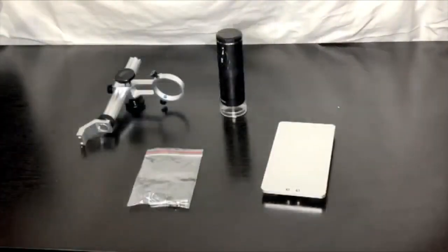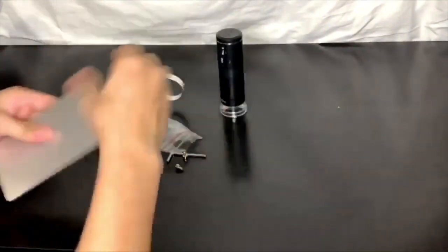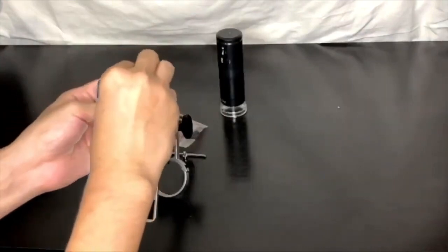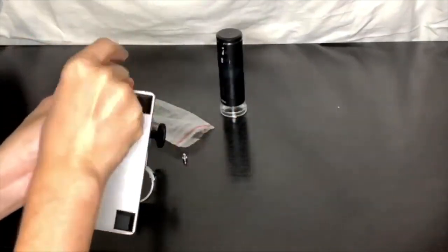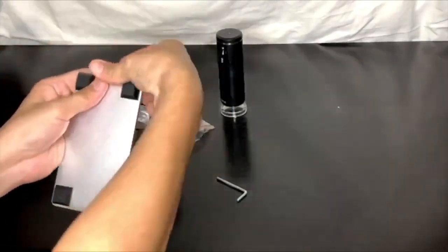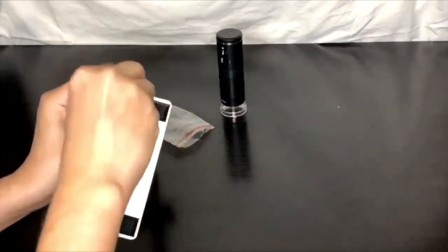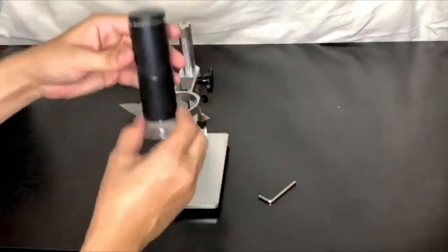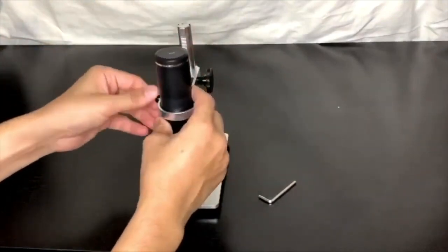Now let's start assembling the microscope. We'll take the mounting hardware out of the bag. Just take the base, turn it upside down, put the bolts into the bottom of the base, tighten them up, then we can place the microscope into the base.